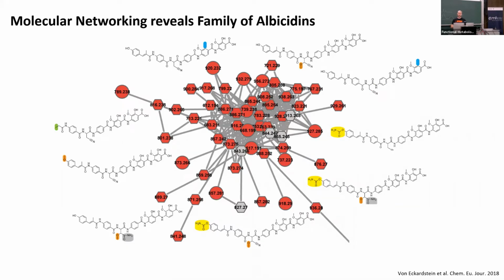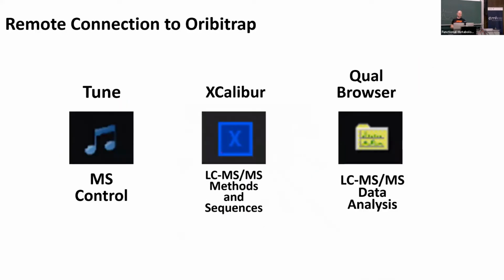So I think this is really useful, and in the next couple of days we will show you how you get this from our test data, but then hopefully also your own data. But okay, so now let's actually acquire some MSMS data.